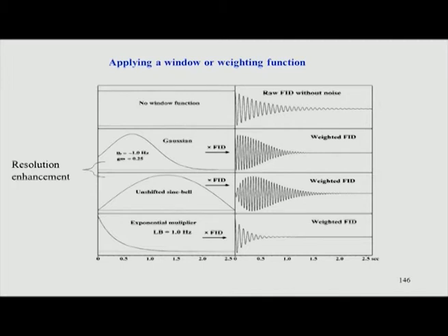So, therefore, if you have two signals, meaning two frequencies which are very close, that is like the speed of the train, then you need to wait a long time in the FID for them to be really separated from each other. In the beginning, the two frequencies will look very much alike. You will not be able to say that there are two frequencies here, but only if you wait for a long time towards this side, then you will start seeing that there are two frequencies.